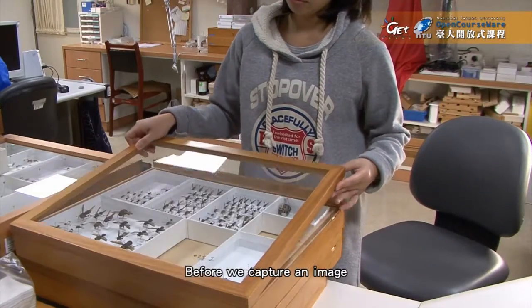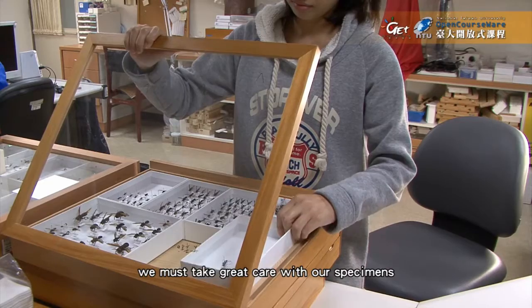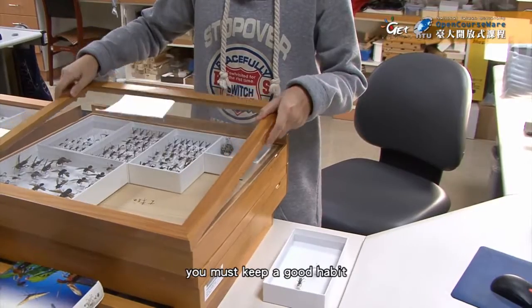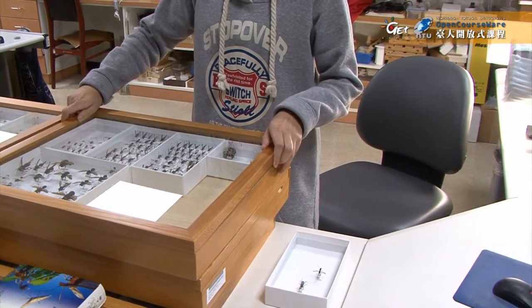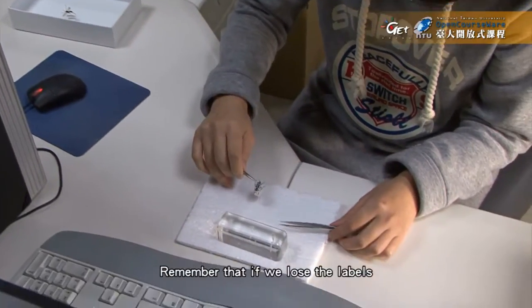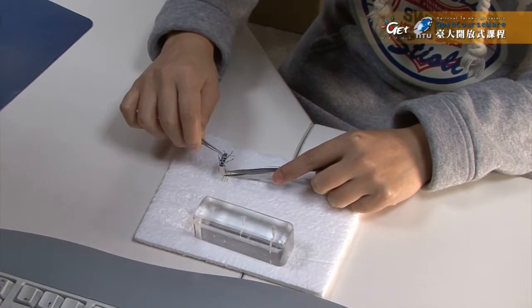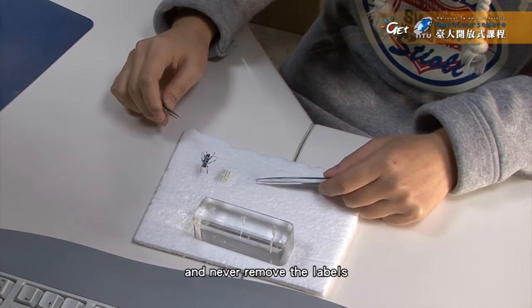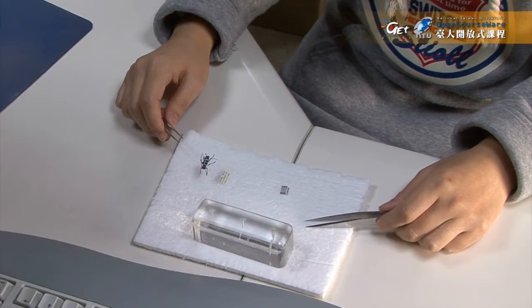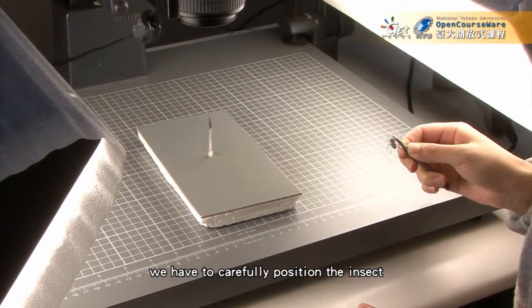Before we capture the image, we must take great care with our specimens. So when we are handling the procedure, you must keep a good habit. The most important thing we must keep in mind: remember that without the labels, the specimen has no value. So treat them with as much care and never remove the label from more than one specimen at the same time. When taking pictures, the first thing is to carefully position the insects.